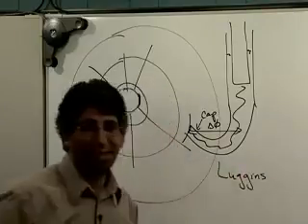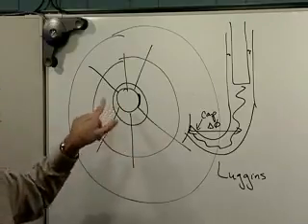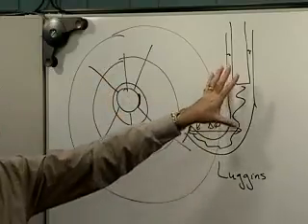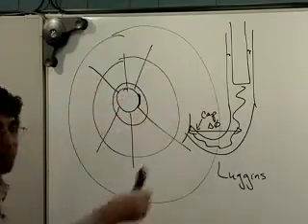And if you want to see the details of exactly how that works out in terms of the E and M, then Gileadi's book discusses this in detail. Okay. You do not have to have a spherical electrode to have this be an advantage. It will work with any shape. So I just drew spherical so I could draw the lines of equipotential easily.